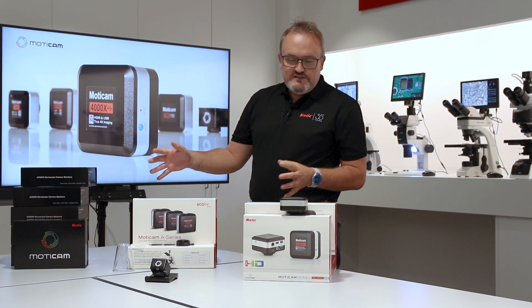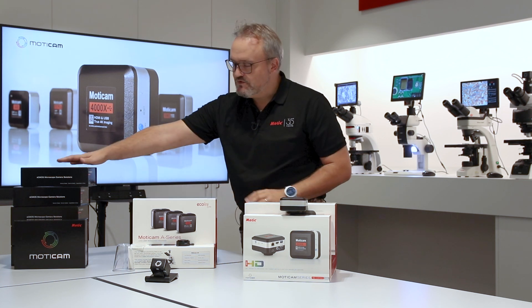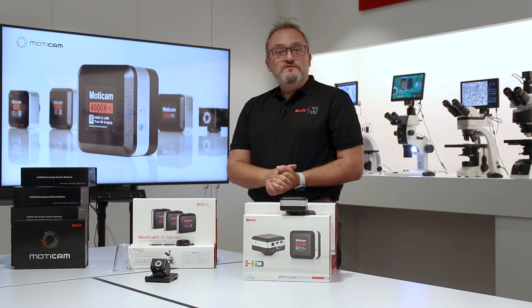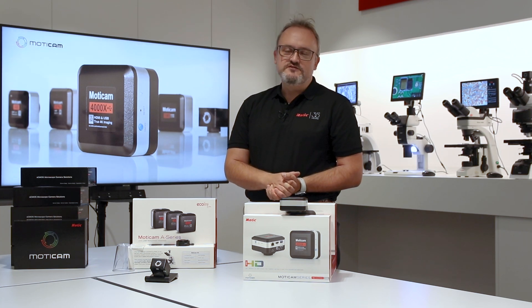These are the different lines: multiple outputs, multiple connections, and professional features. If you have any other questions, please don't hesitate to contact a Motic dealer near you.